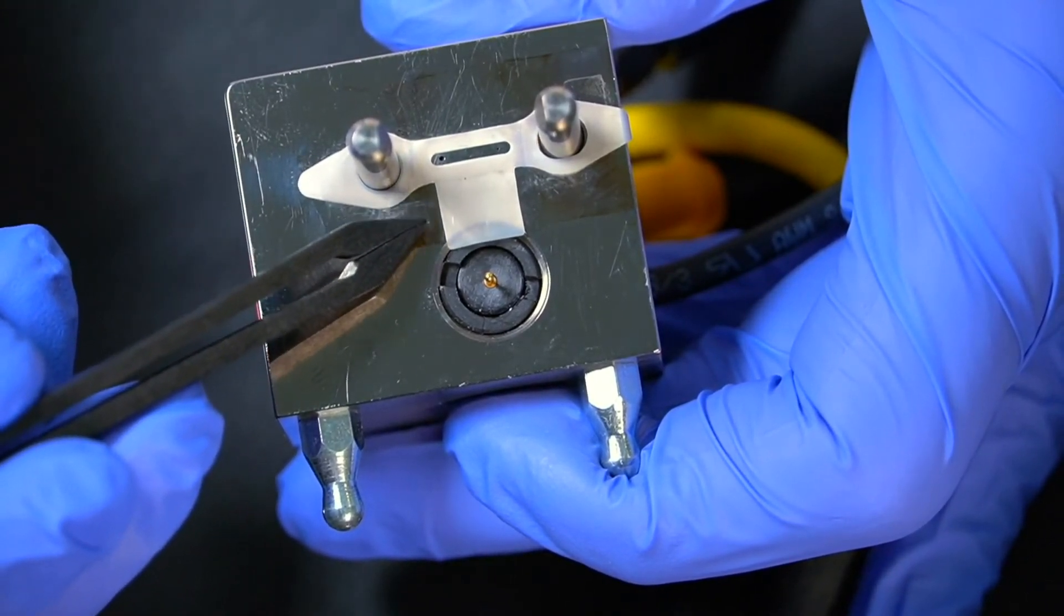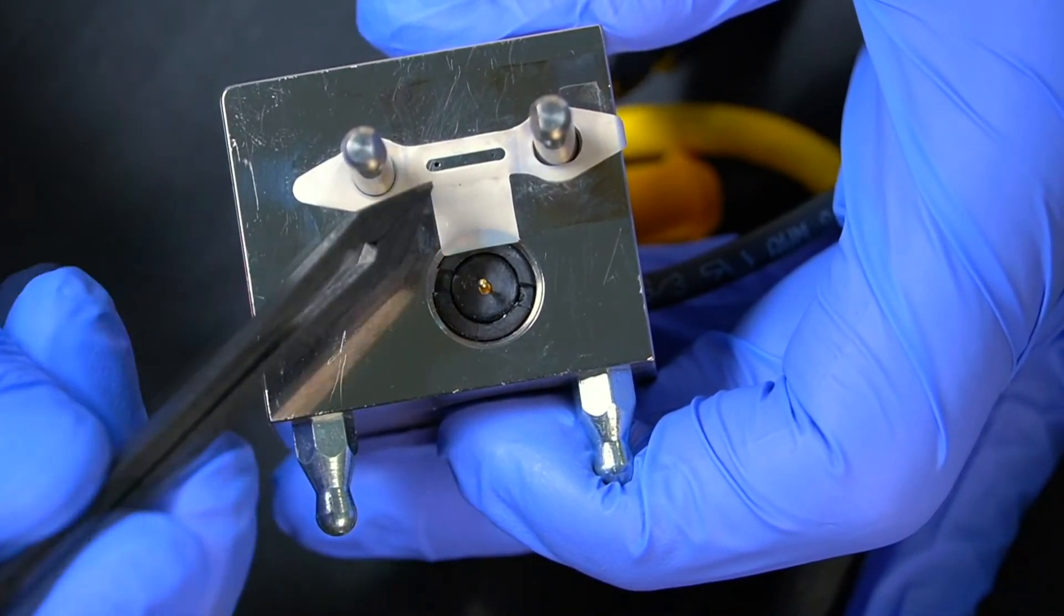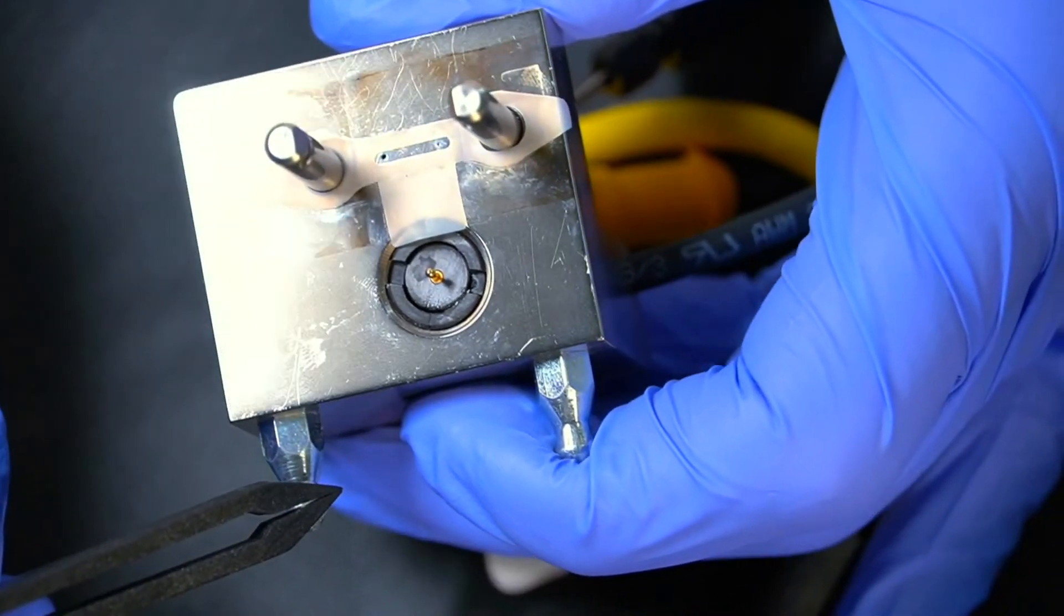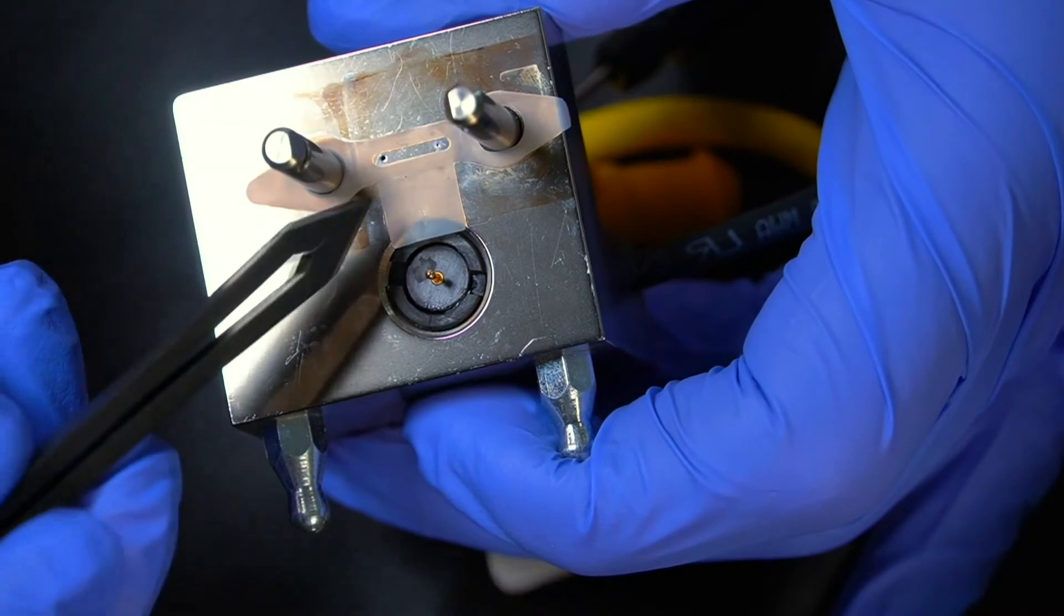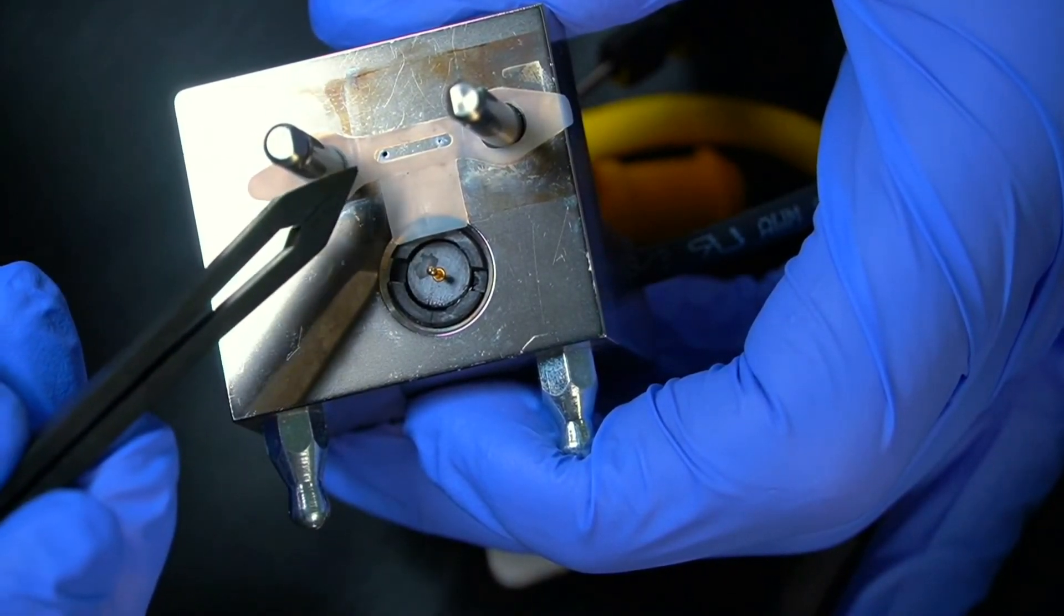Now looking more in detail at the gasket, if you look at the little slot here and if I just rock it over to one side, you can just about make out within the slot there's a little hole at each end. Those little holes are where the eluent flows in.